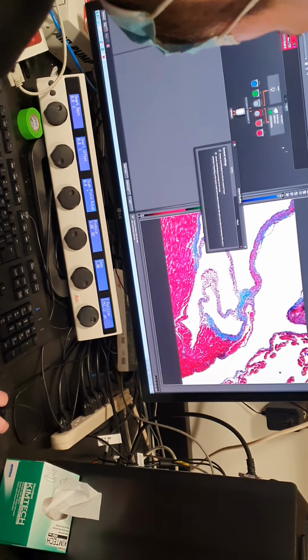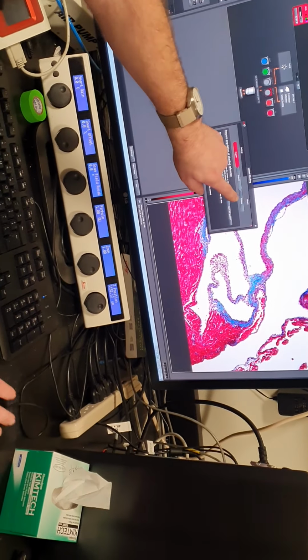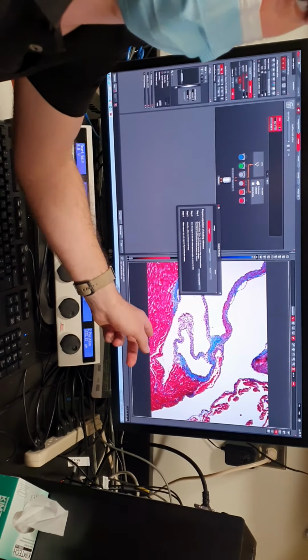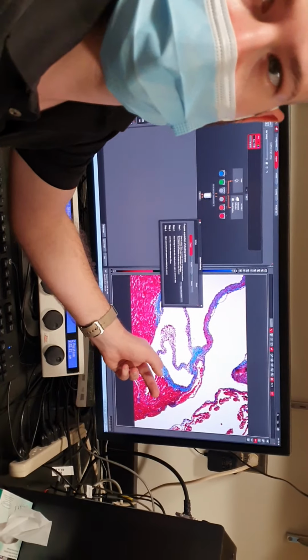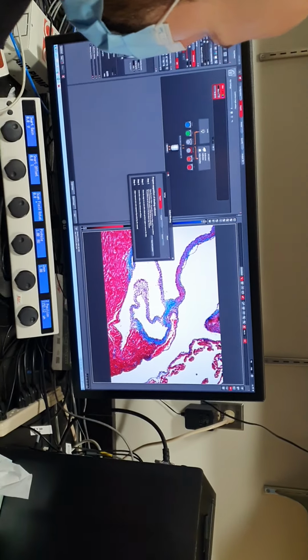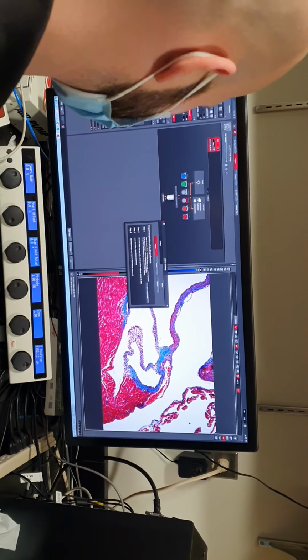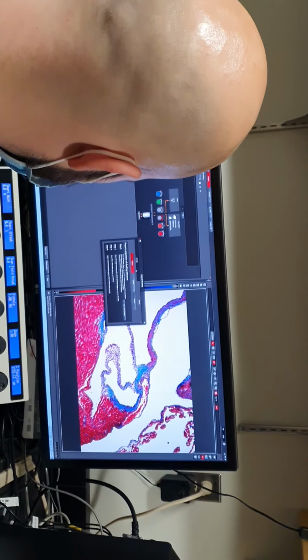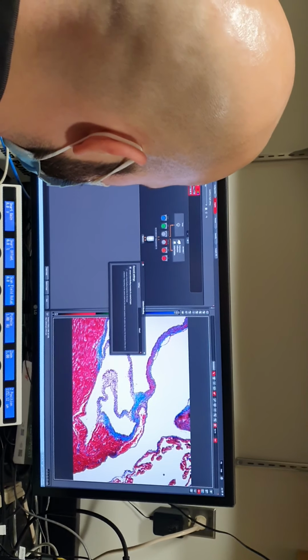Where did you go for restore? It was the last step on the wizard, and it just takes us back to the same position and focus that we had saved as the first step. It makes it easy to get back to where you started because you had to move off the sample, but you can always just manually move back to the sample as well. And here, we'll tell it to activate that.